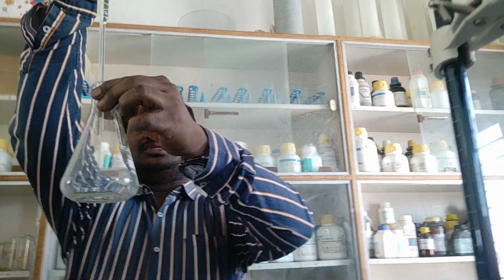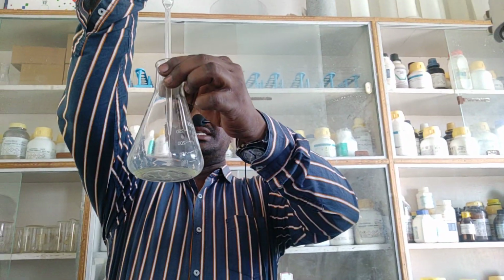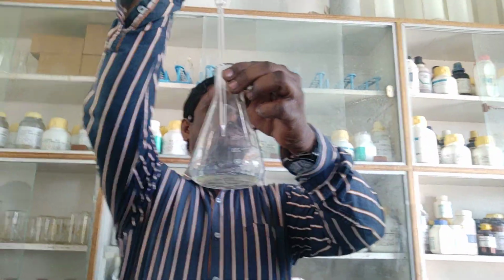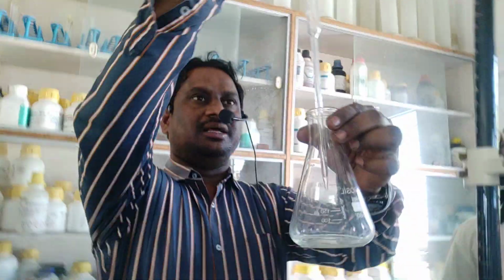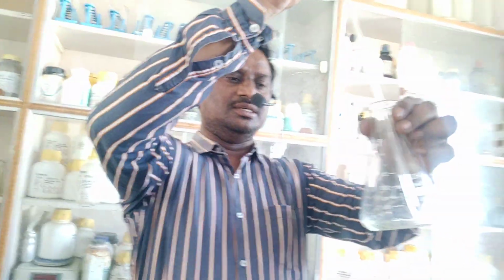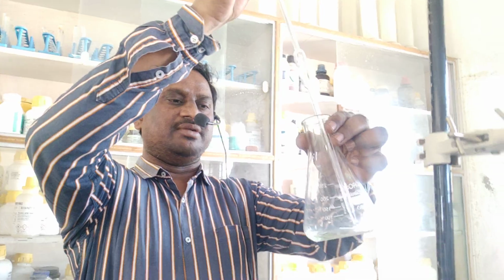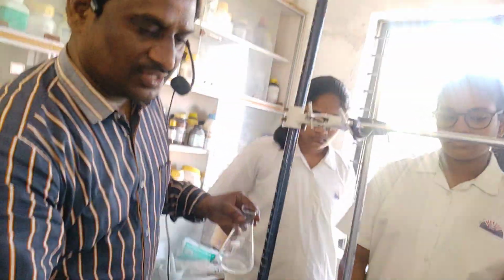10 ml. So 10 ml of FAS solution I am transferring into the conical flask. Clear? Exactly 10 ml. Don't take above the mark or below the mark. Exactly 10 ml only should take. So this 10 ml I am transferring. Just keep it like this, so whatever is there in the pipette will also come down. Like that, you transfer 10 ml solution.